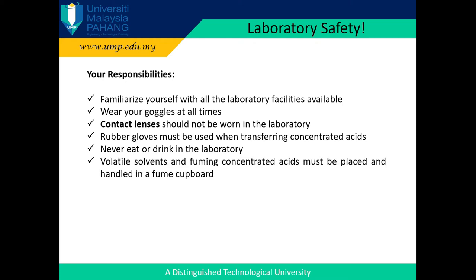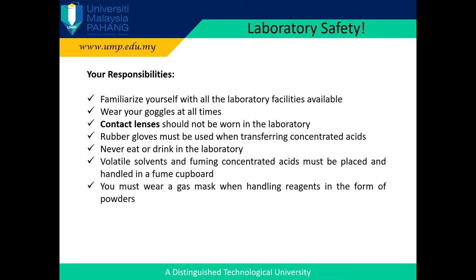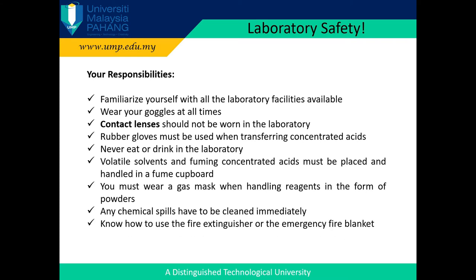Volatile solvents and fuming concentrated acids must be placed and handled in a fume cupboard. You must wear a gas mask when handling reagents in the form of powders. Any chemical spills have to be cleaned immediately. Know how to use the fire extinguisher or the emergency fire blanket. Lastly, all bottles and containers should have complete labels.